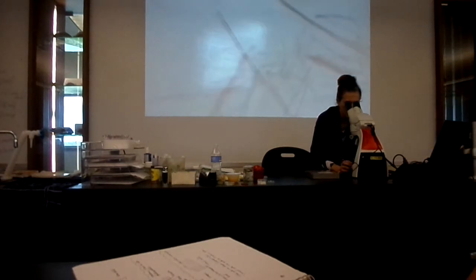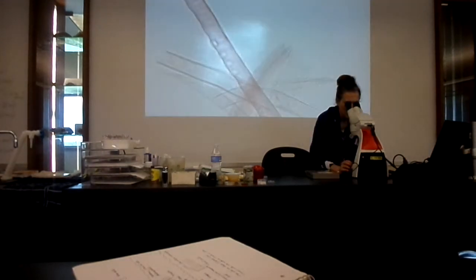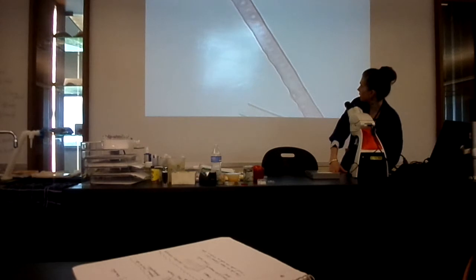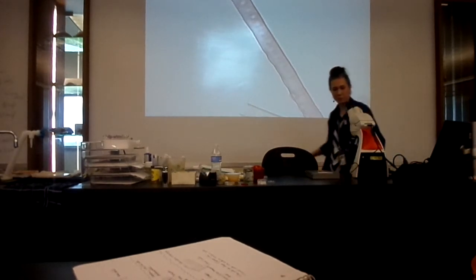Here we go. Here's several of them right here. Tracheids are long tubes. And they kind of look like a flute maybe. Okay. So they're wide.